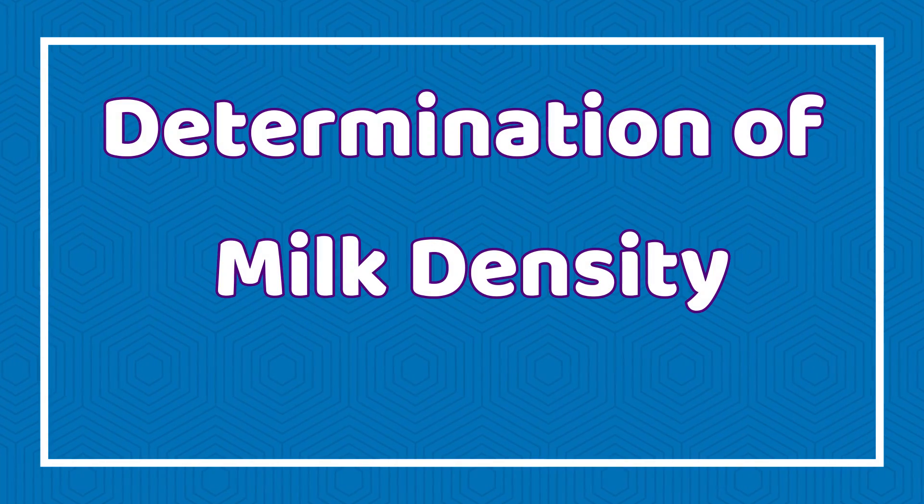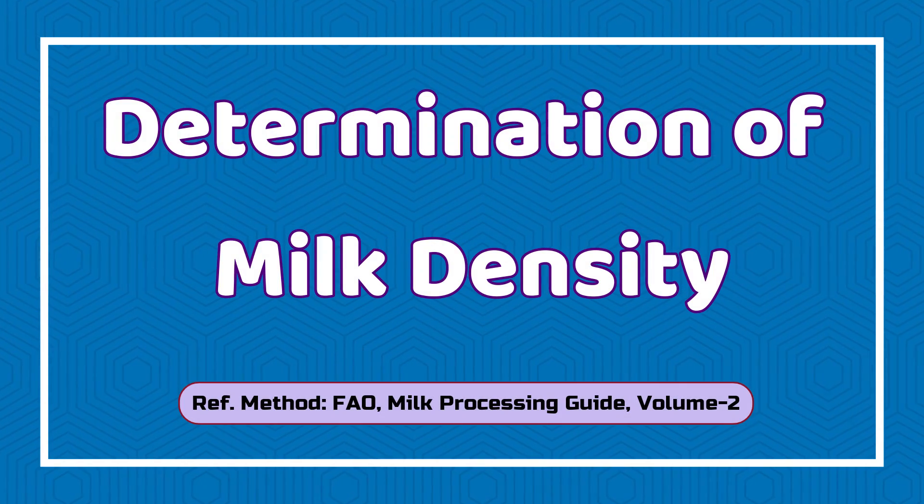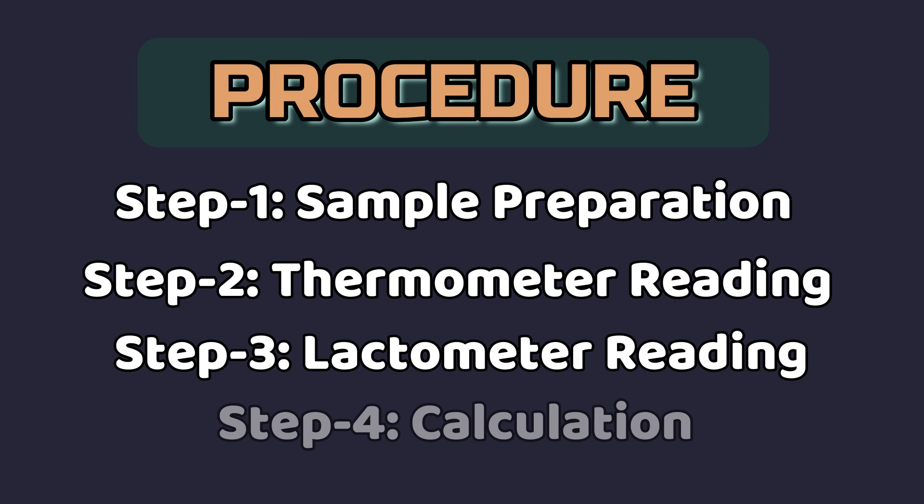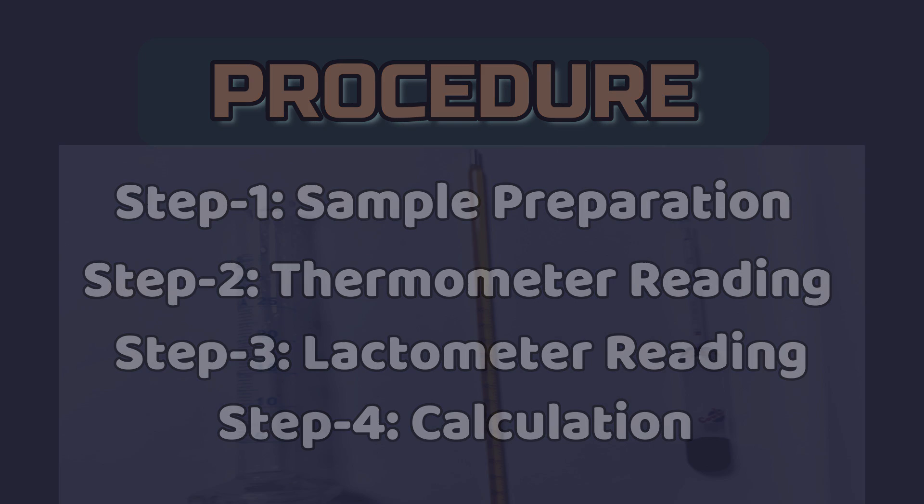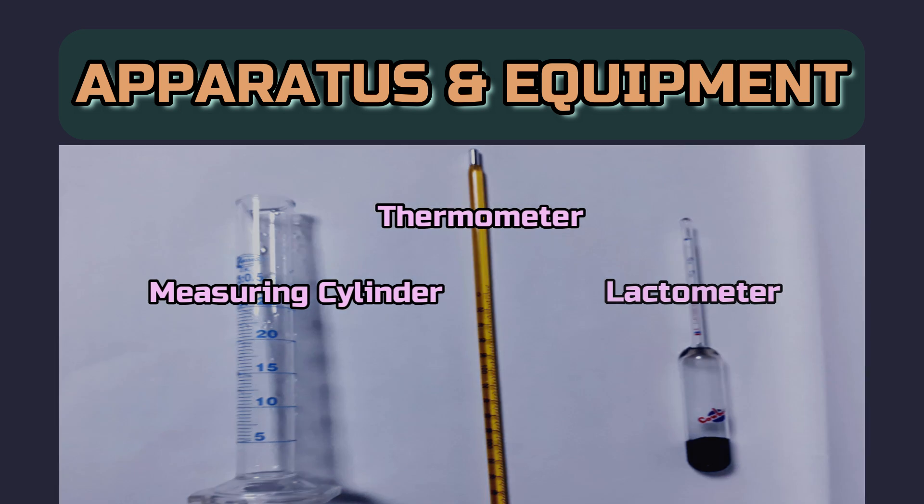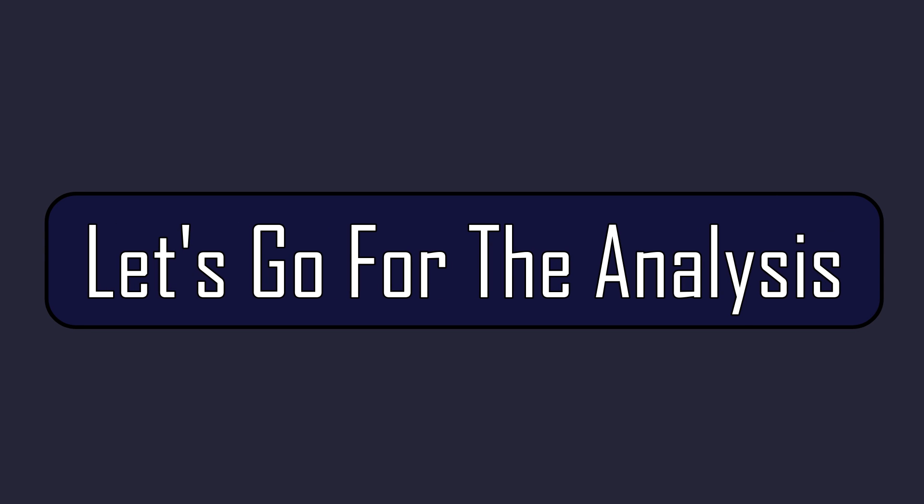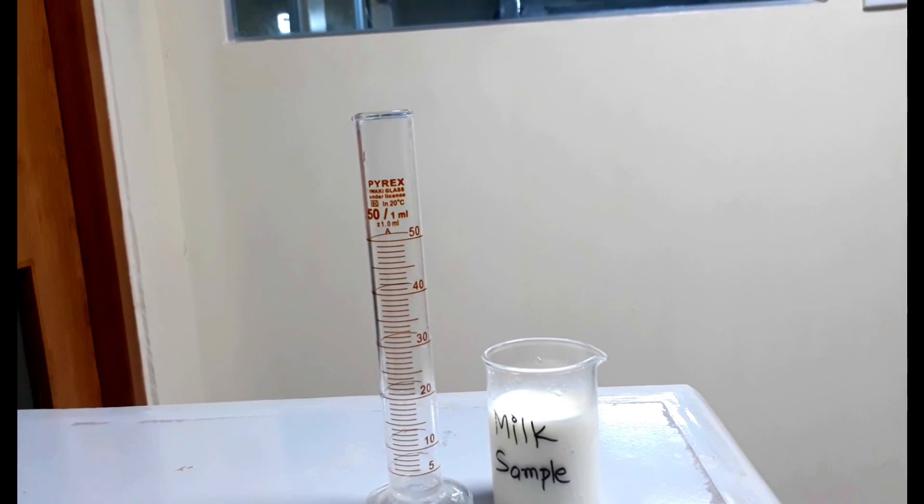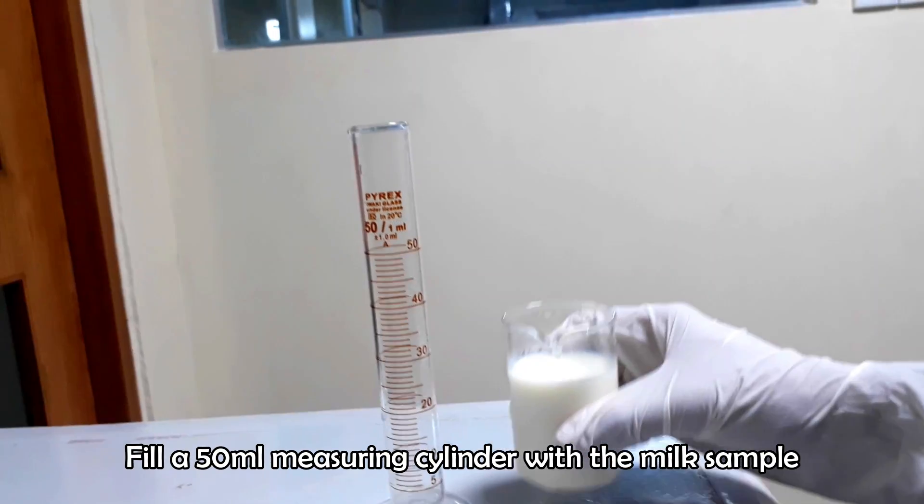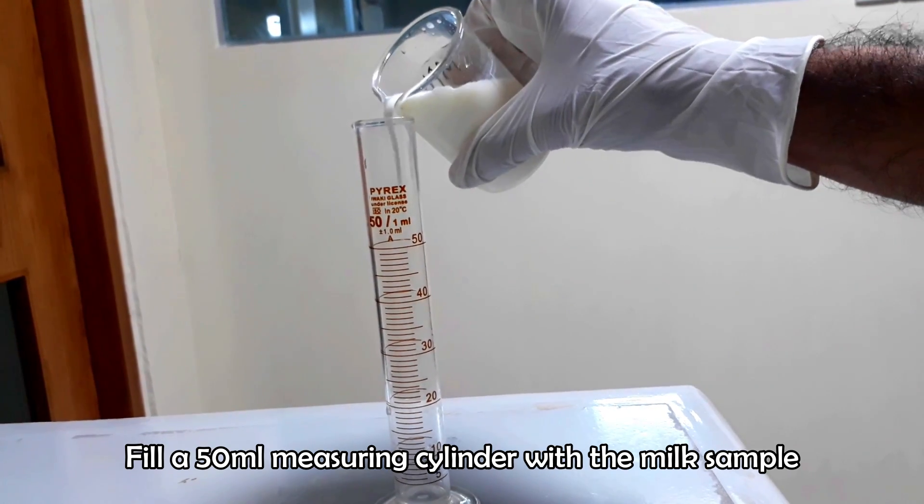Hello viewers, in this video we will show you the procedure for determining milk density using a lactometer. Steps for the test are sample preparation, thermometer reading, lactometer reading, and calculation. To conduct the test, we need a lactometer, measuring cylinder, and thermometer. Let's go for the test. Fill a 50ml measuring cylinder with the milk sample.